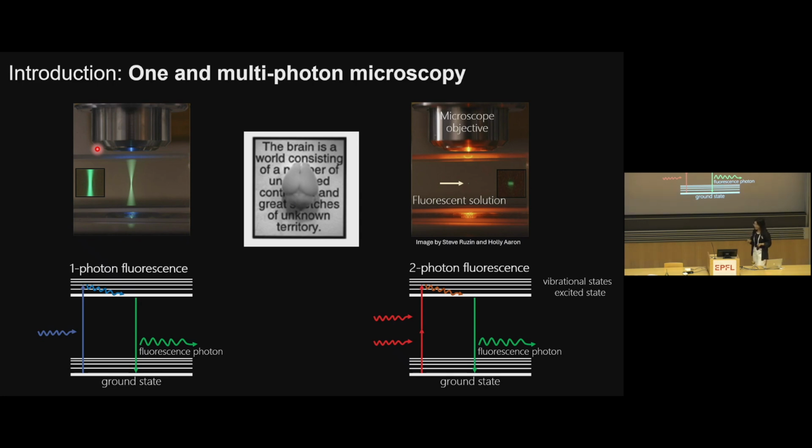So the solution in the optical community is really to design a better excitation scheme to avoid the way we visualize the cells within the tissue. So here I introduce you a scheme. It's what we call multi-photon excitation. Compared to one-photon excitation, where we have only one photon to excite one fluorophore, what we did is we used two photons or three photons simultaneously in order to create a nonlinear response of this point spread function, so that what you see on the right-hand side is that this point spread function becomes highly localized, so that we create an optically confined volume that allows us to reject all the out-of-focus background.